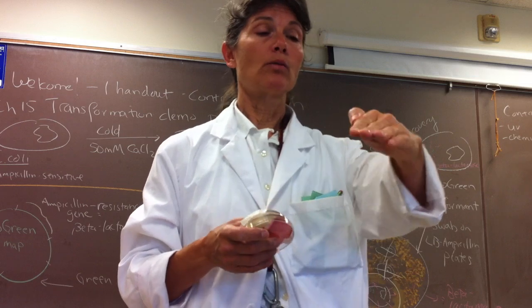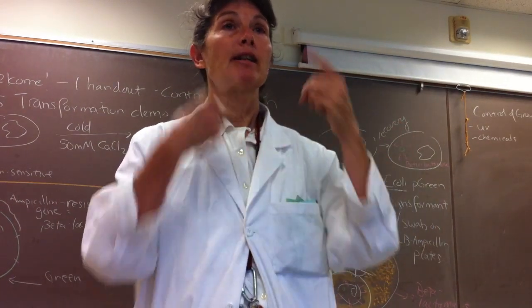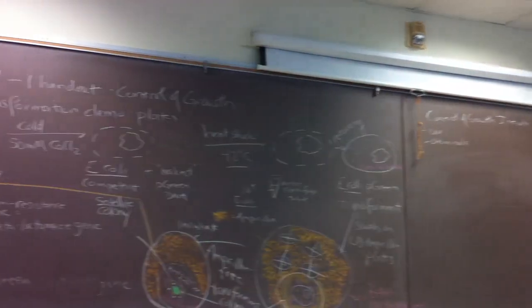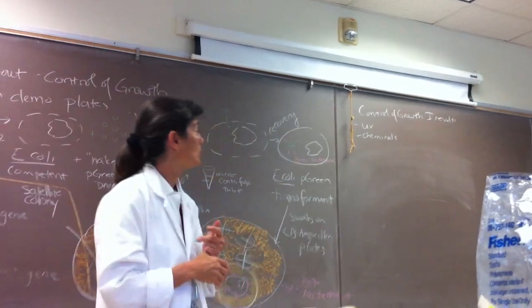Okay, what is the risk if we expose ourselves to UV light? Skin cancer. Skin cancer and eye damage, right? So just remember that you want to protect your colleagues out there in the real world. Good. So you want to make note of that, record it in your lab notebook.